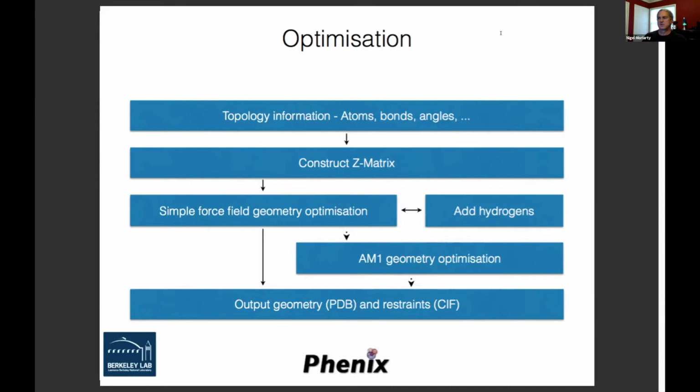I should point out that if you're working on novel ligands in the drug setting, where you're working on creating drug targets, this is not quite as common in cryo-EM, but it's not uncommon. Some pharmaceuticals are doing drug design studies using cryo, so this may actually come into play at some point.